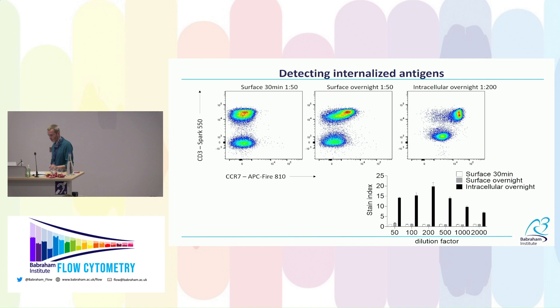The effect can be quite dramatic for antigens that are low expression or internalized. CCR7 in lymphoid organs undergoes constant internalization due to engagement with ligands CCL19 and CCL21. With a short surface stain — even using a relatively bright fluorophore — we get basically no staining on T-cells. With overnight staining on the surface we start to pick it up, but by including CCR7 in the intracellular staining mix we can detect the entire cellular pool including the internalized fraction, giving a massive boost in signal.